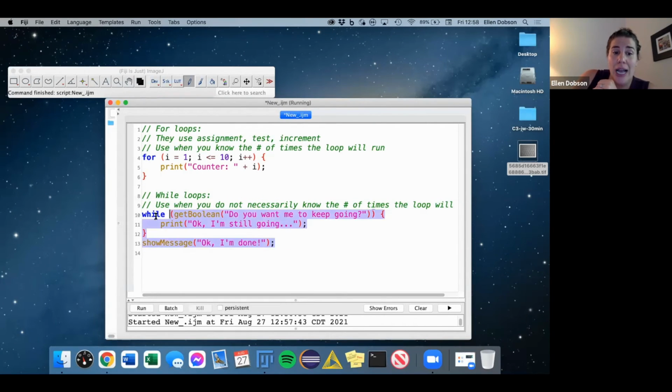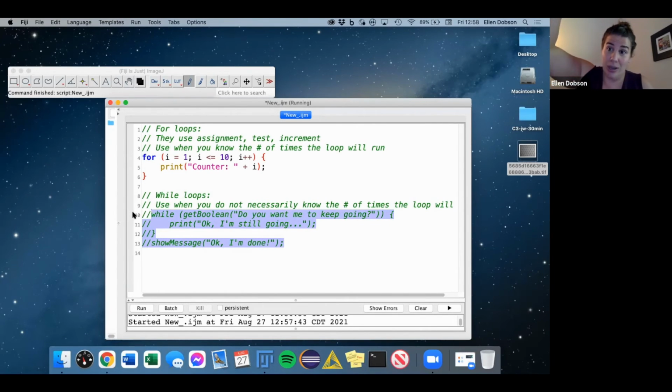So I'm actually going to highlight all of these lines here. And if you hit, I think it's shift. Nope, undo. Okay, never mind. It's command backslash, and then you can comment out multiple lines, at least on a Mac, as opposed to having to comment out each line. You can comment them back in and out by just holding shift and hitting the backslash key.